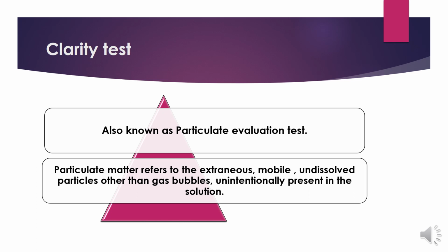And basically they are undissolved particles, because particles that become dissolved we would be unable to check in the preparation. So particulate matter are the particles that remain undissolved in the preparation even after entry into the solution. They shouldn't be confused with gas bubbles.